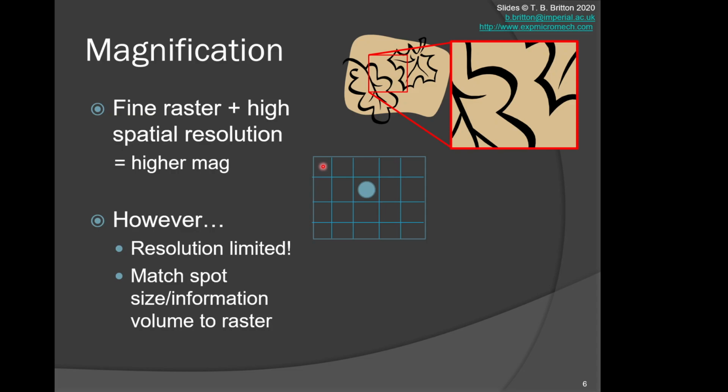Broadly, if you've got a material, you've got to consider the likelihood of hitting a characteristic average signal that describes the totality of the separation between point A and point B, the stepping of our raster scan. The convenient method to get this right is to try and match the spot size to the information that you're accessing, i.e. match the spot size or the condenser lens settings for the raster that you're going to do.